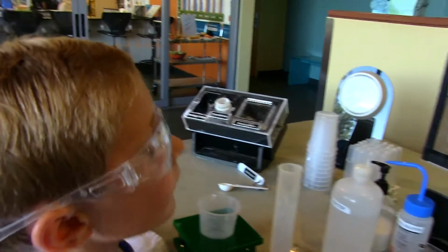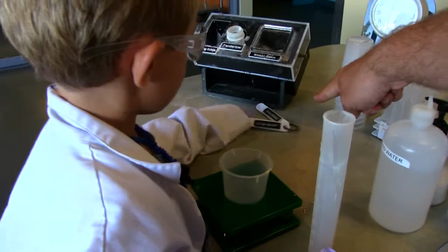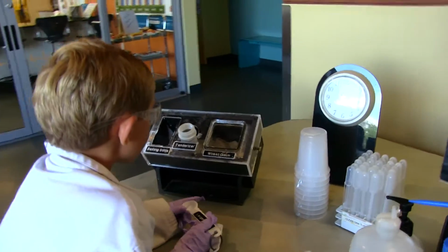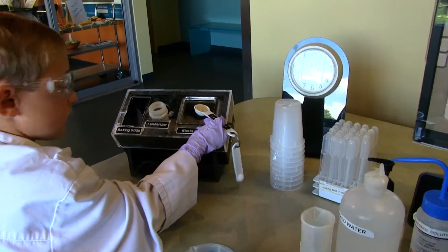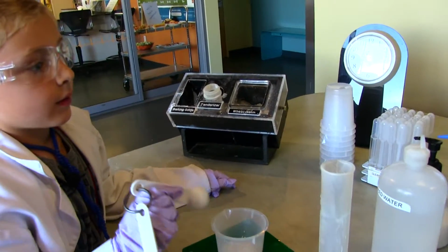Using a large spoon, add 1 scoop of wheat germ to the water. Okay, use the large one and add 1 scoop of wheat germ. Which one's wheat germ? Wheat germ? Add 1 scoop of wheat germ to the water. Good job. Now what do we do?